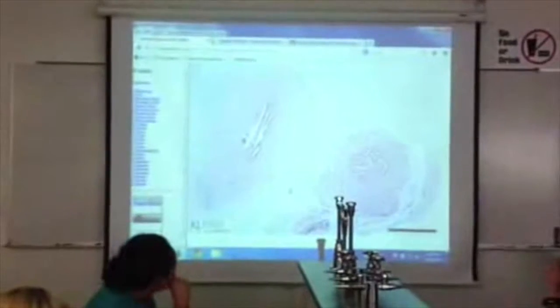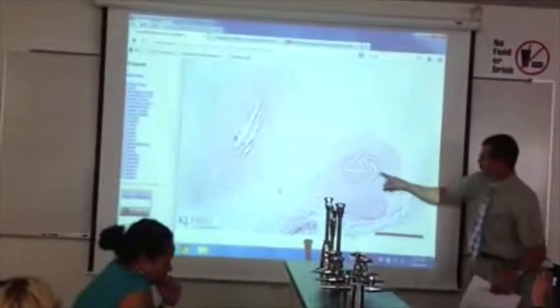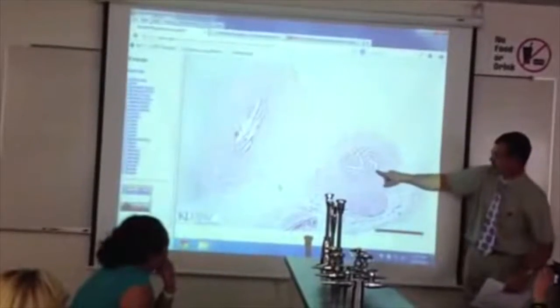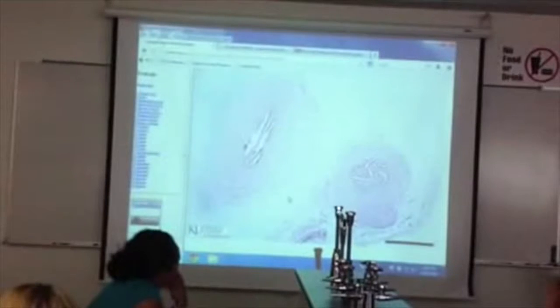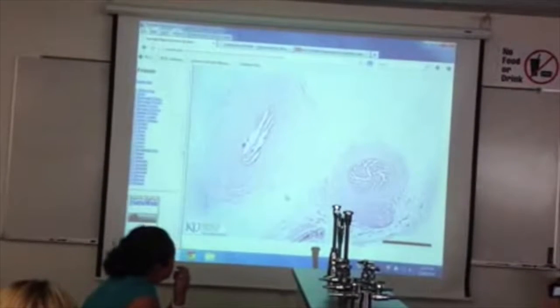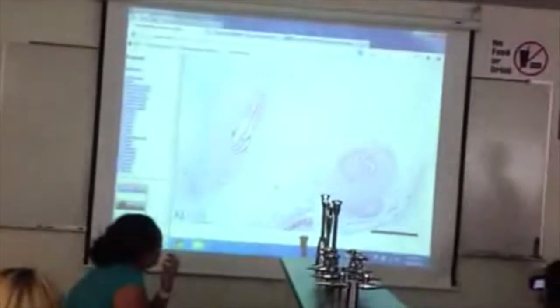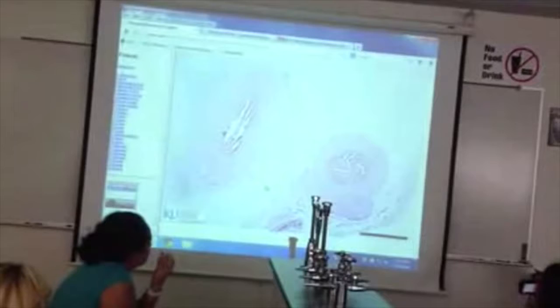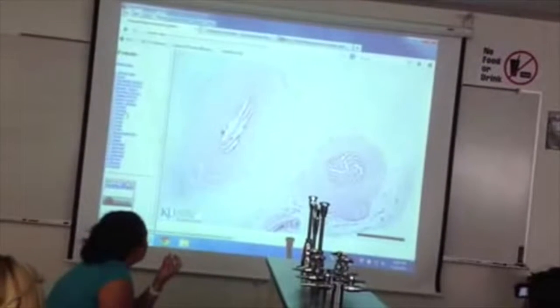And just to show you that it varies somewhat, the oviduct's on the right. So again, you can tell the tube, you can tell there's muscle, but not as much, and then this is sort of strange. So it varies a lot, but you get the idea, snowflake with a little bit of muscle. And what's that on the left? That's a vein. Let's zoom in on my uterine tube, shall I?